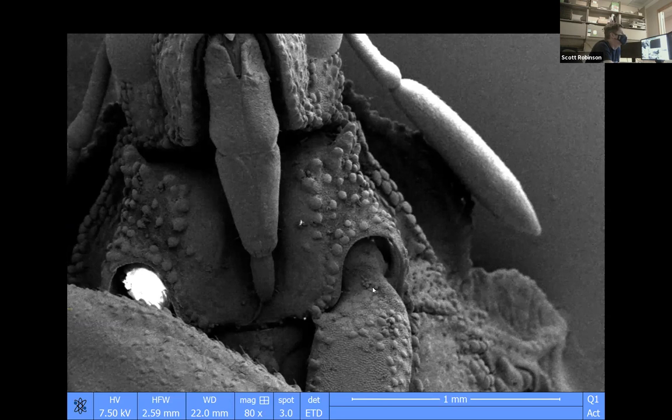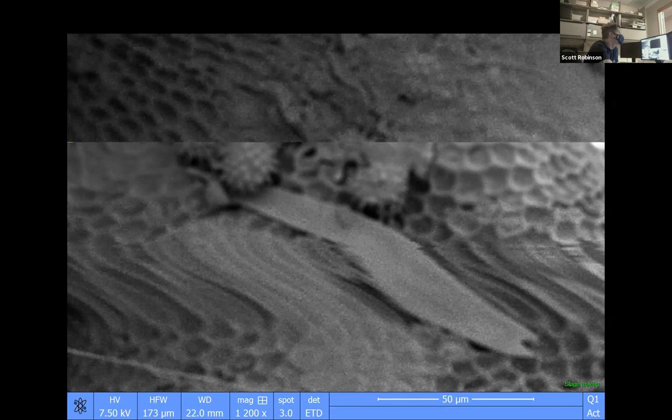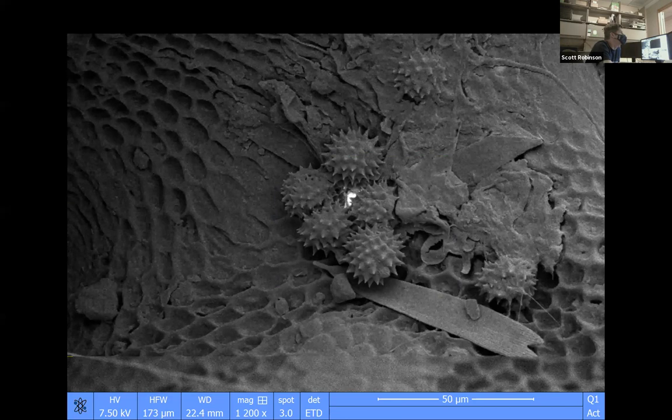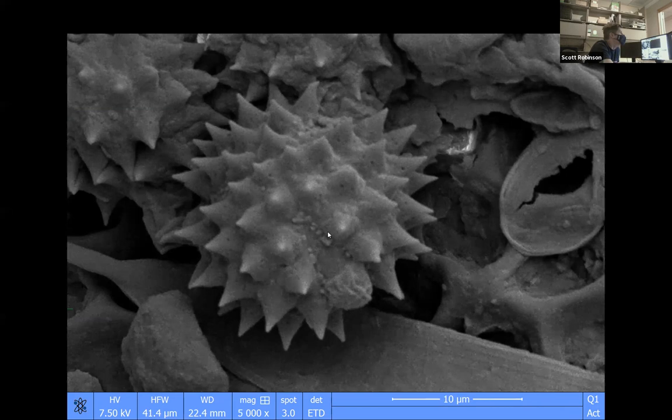I've got a colleague and friend who has expertise in this particular assassin bug, so I might shoot him a text later today and see if he knows what the function or the name of those bumps are. So these are little pollen grains that are also stuck to the assassin bug. Really, really cool.